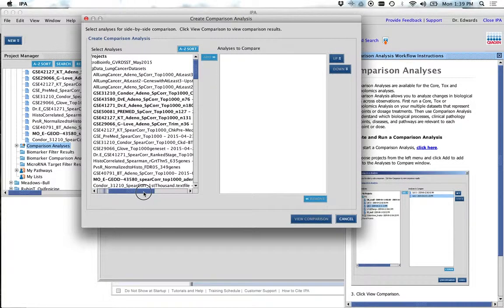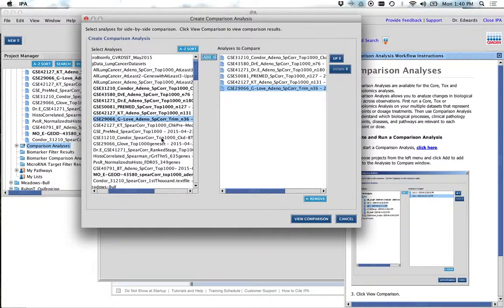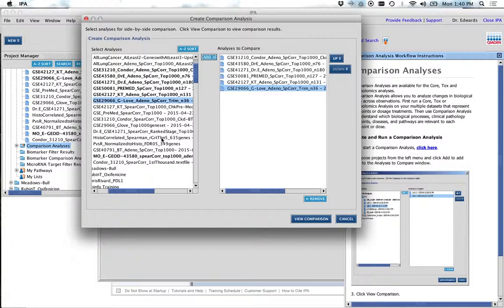Yeah, we've done a lot of stuff. So here's what I'm going to do. I'm going to take these gene lists and I'm going to start adding them. There's Condor, there's me. There's me again. I think that was Mario's list. We're going to have to check your list, Mario. There's Pre-Medi, KT's original list, G-Love. Am I missing anybody? Yeah, where's yours? Oh, yours is down here. Actually, you had a pretty decent list. I'm going to move yours up a little bit. Yeah. All right.